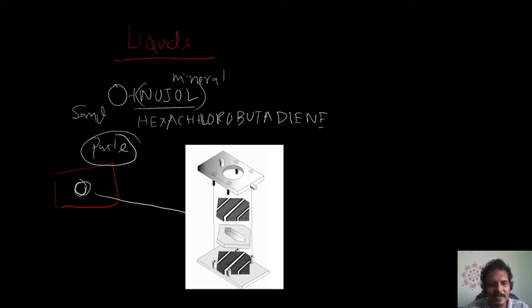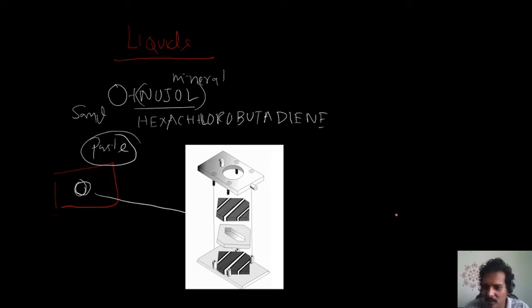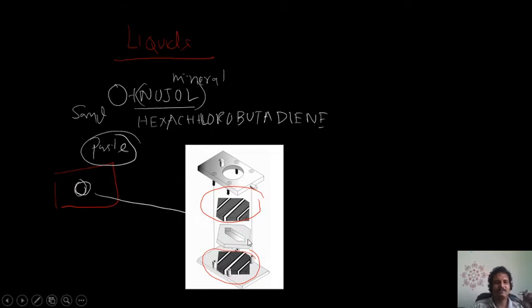ஒரு paste மாதிரி ஆக்கிறாங்க. ஆயில்ல மிக்ஸ் பண்ணா என்ன ஆகும், பிசுப்பா ஒரு பேஸ்ட் மாதிரி ஆகுதுல்ல, அதான் இது இங்கே வச்சிடுறாங்க. வச்சுட்டு on either side you are closing it with potassium bromide windows. Okay, so இது ரெண்டும் என்னன்னா sodium chloride அல்லது potassium bromide window. இப்போ இது மூணுமே ஒரு something like a sandwich.